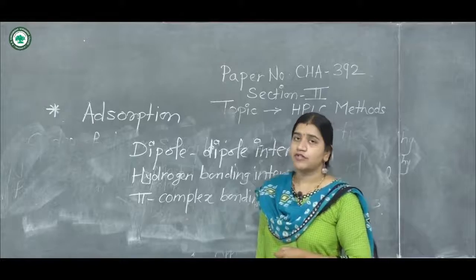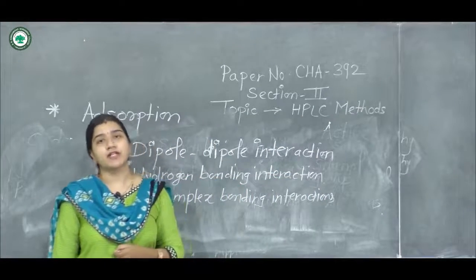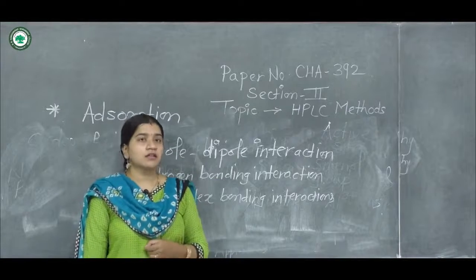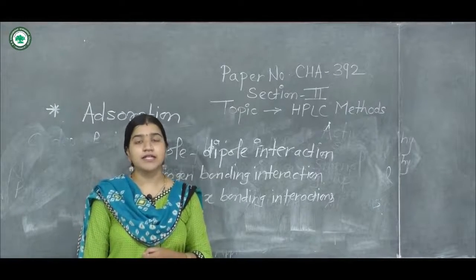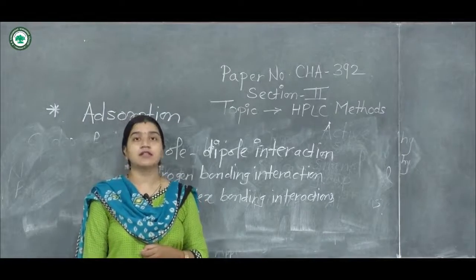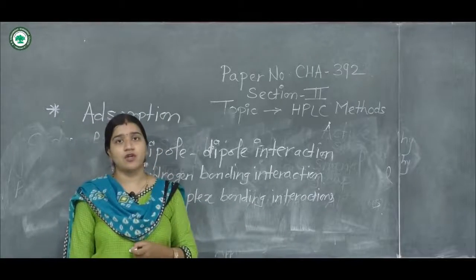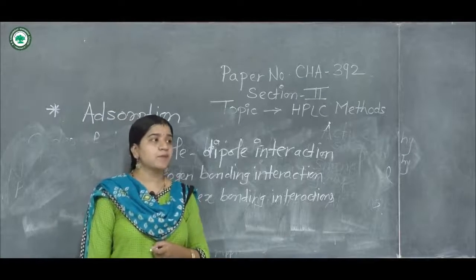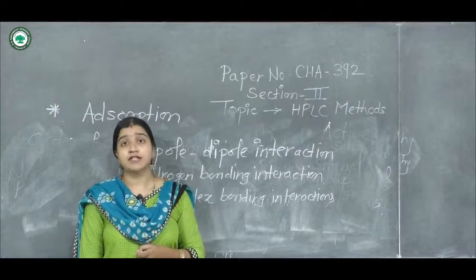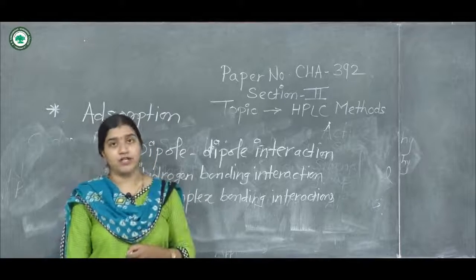We have also discussed a little bit related to these different interactions while studying the nature of partition forces in the fundamental concepts of chromatography. Dipole-dipole interaction, as all of you know, is when the molecule develops a delta positive as well as a delta negative charge.